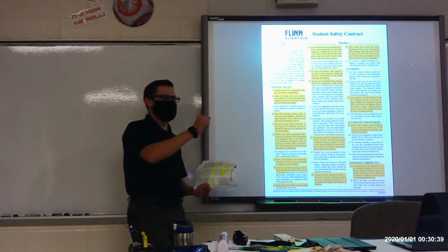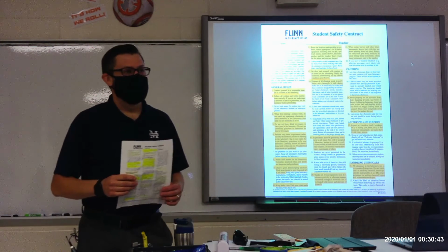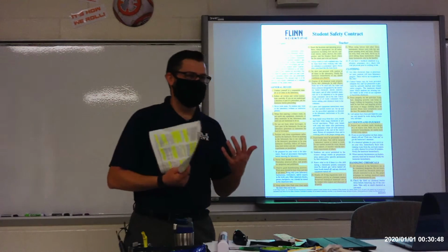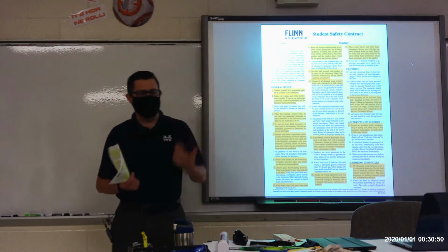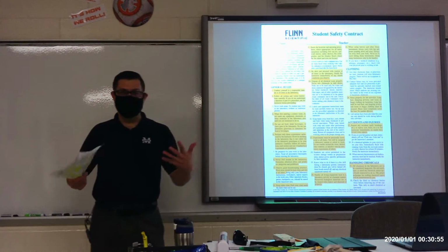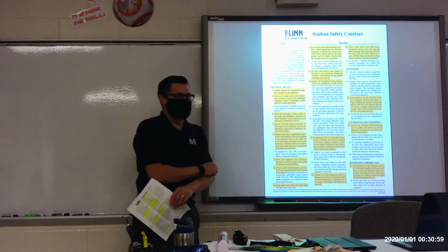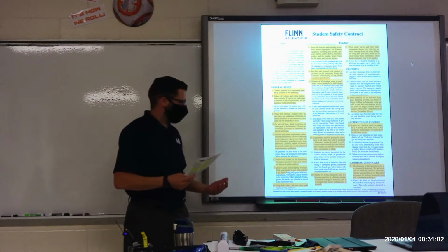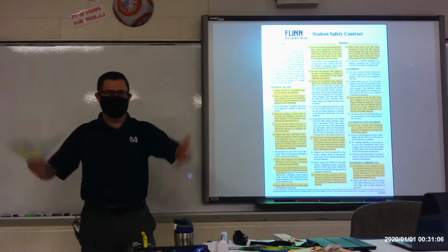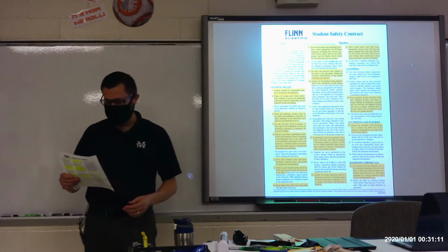Did you have a question? If it's a particularly dangly necklace, then yeah, you can probably just tuck it into your shirt. The idea is you don't want anything loose getting in the way of what you're doing. Again, we're not likely to be doing anything where you're going to get too tangled, but the hair is kind of the biggest thing because some of you have really long hair. So as long as you can get it out of the way so it's not interrupting what we're doing in the lab, then it should be fine.